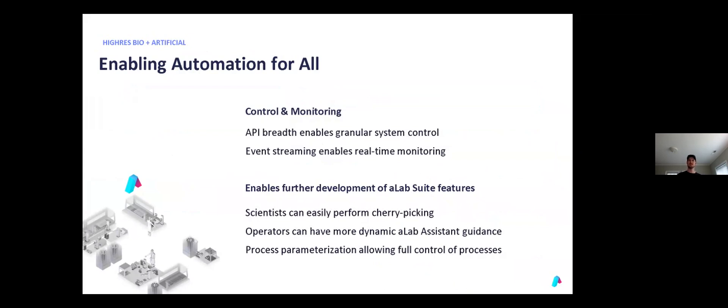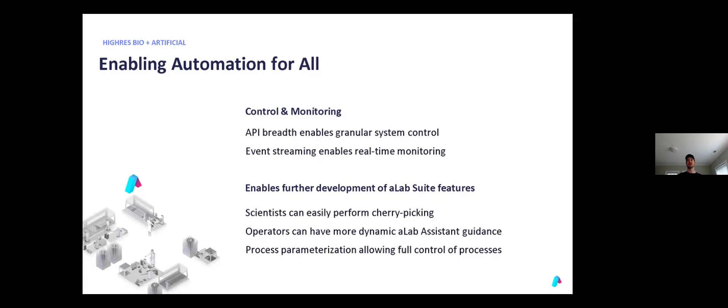And then some of the future things we're excited about working on is building within Solario and A-Lab a way for scientists to come in and build out cherry-picking methods on liquid handlers just using the A-Lab Suite UI, making our assistants better so that when an assistant needs a user to check the particular nest and a piece of equipment is empty, we can have the assistant call a method within Solario to open that nest or open the door and present the nest to the user so that they can confirm it's empty. And so we can use Solario API to do that without having to write a full process in Solario to just open the nest.